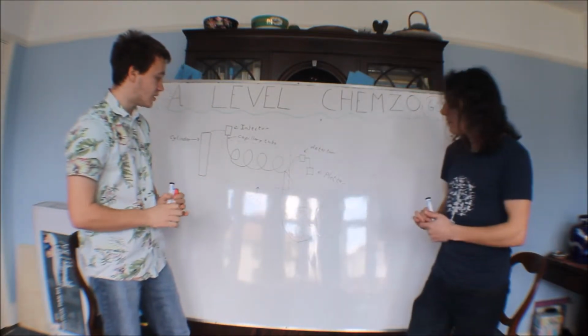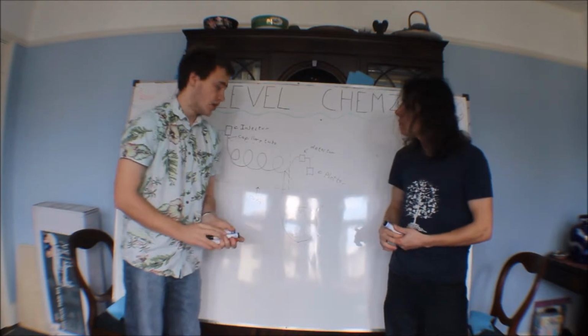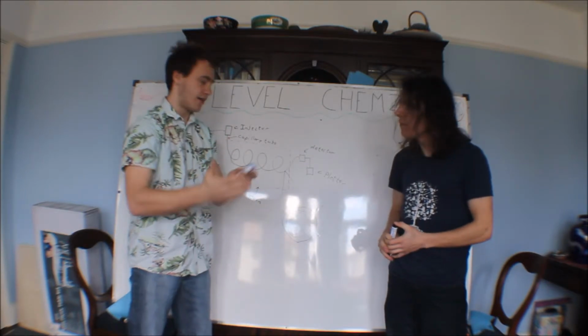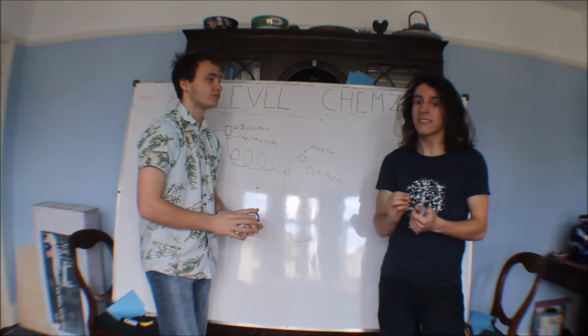Triv has done a cross section of part of the capillary tube. On the outer layer, we'll have some sort of insulation. That's useful because it's in an oven, and the oven's going to have varying heat, so we want it to stay relatively the same heat. Then we have our stationary phase.